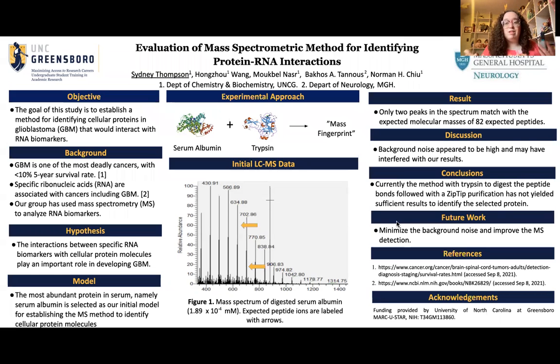And we're treating it with two methods of basically purification, a guanidination reaction and ZipTip purification. And we're seeing if these purifications help us see it better in the mass spectrometer, which we're going to see right down below. So the mass spectrometer shows us the proteins basically and their masses. That's what each of these little spikes are.